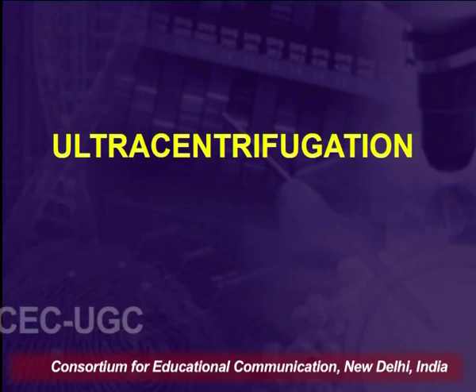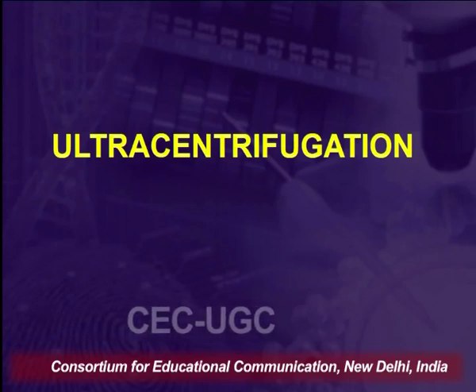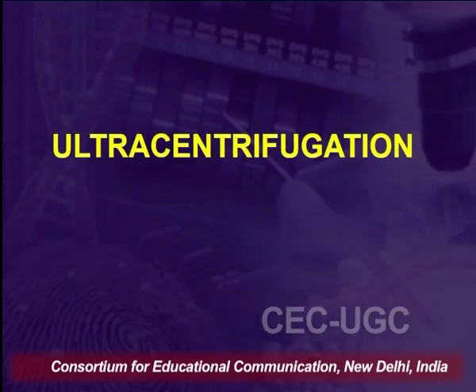Now another important technique here is ultracentrifugation, a term applied by Swedberg to any centrifuge that permitted observation of the contents of the container during the act of centrifuging.